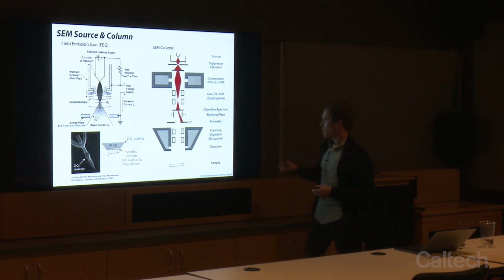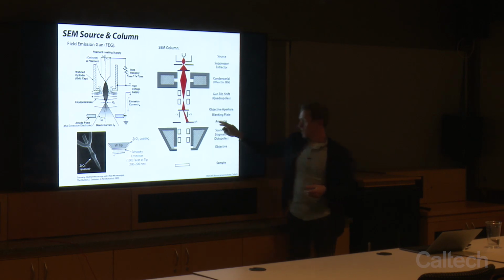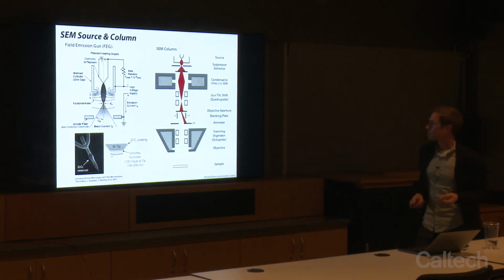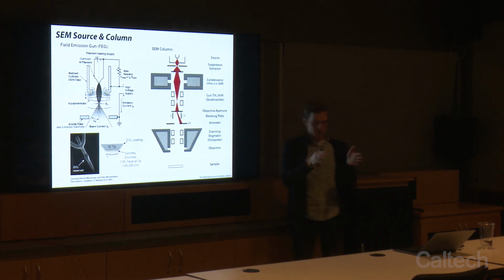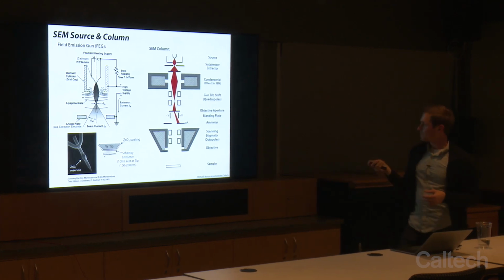We can apply a voltage to this blanking plate, and we can measure the current through an ammeter, and it also prevents us from exposing our sample to electrons when we don't want it to be. And the last thing I didn't mention, these gun tilt and shift quadrupoles are used to sort of steer the beam, and I'll show examples of doing that.